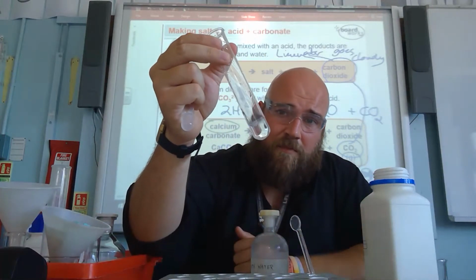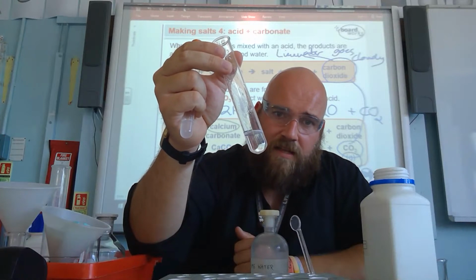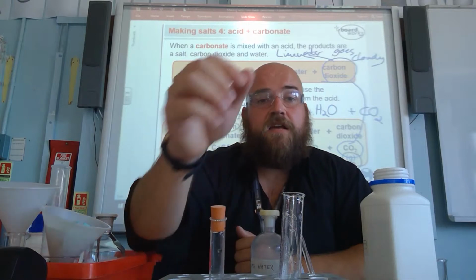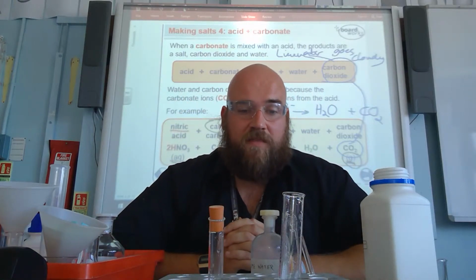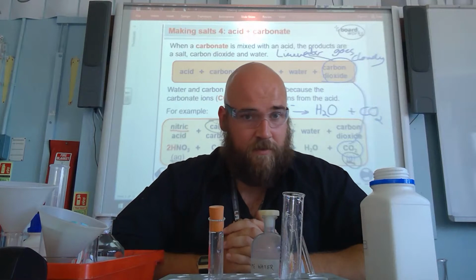And one thing you'll notice as well is that the solid has disappeared. Okay, just a little bit left reacting. You can see those bubbles. But that white solid has disappeared. The two observations have been proven to be correct. And that's true for any carbonate, right? So any carbonate will react with the acid to produce a solution, carbon dioxide gas, which will turn lime water cloudy if you were to bubble it through it somehow.